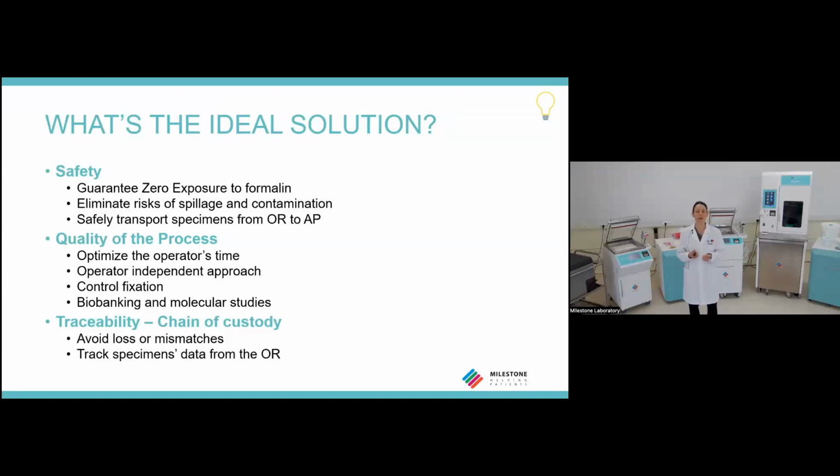We need a procedure not operator dependent, a procedure where the fixation is standardized and documented. We need a procedure that allows the pathology lab to do biobanking and molecular studies when they need. And we need, of course, a procedure where the traceability is a must and is done in a correct way.